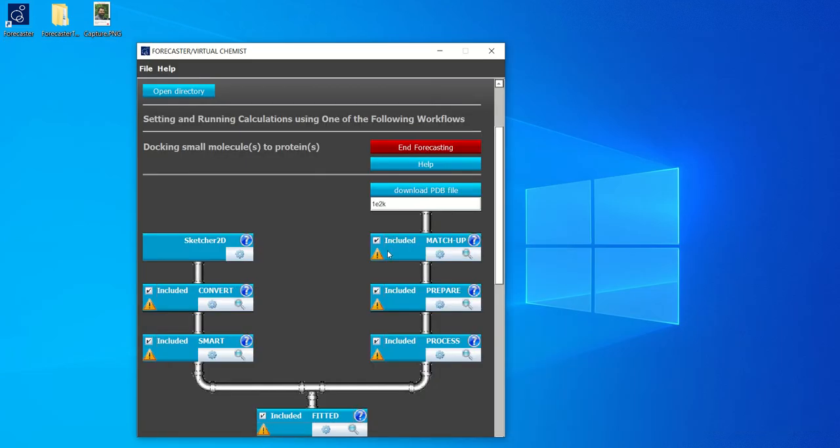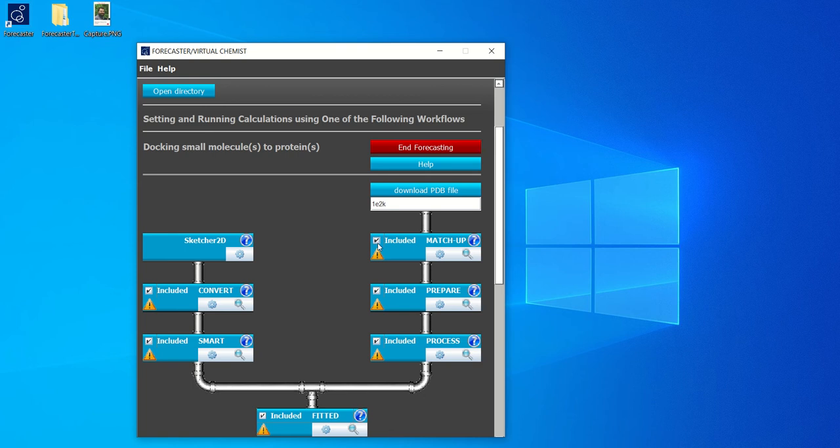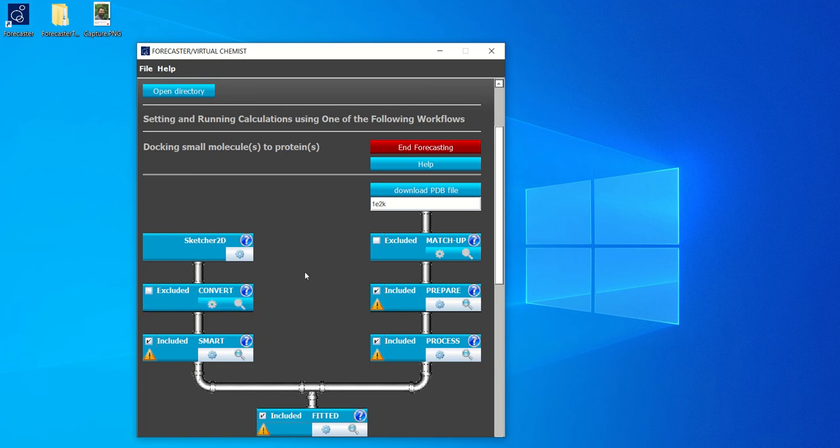There are a few modules in this workflow that we will not need for this specific tutorial. So we'll go ahead and exclude them. One of these is matchup, which superposes different protein structures. So we'll exclude this as well as convert, which converts 2D structures to 3D structures.